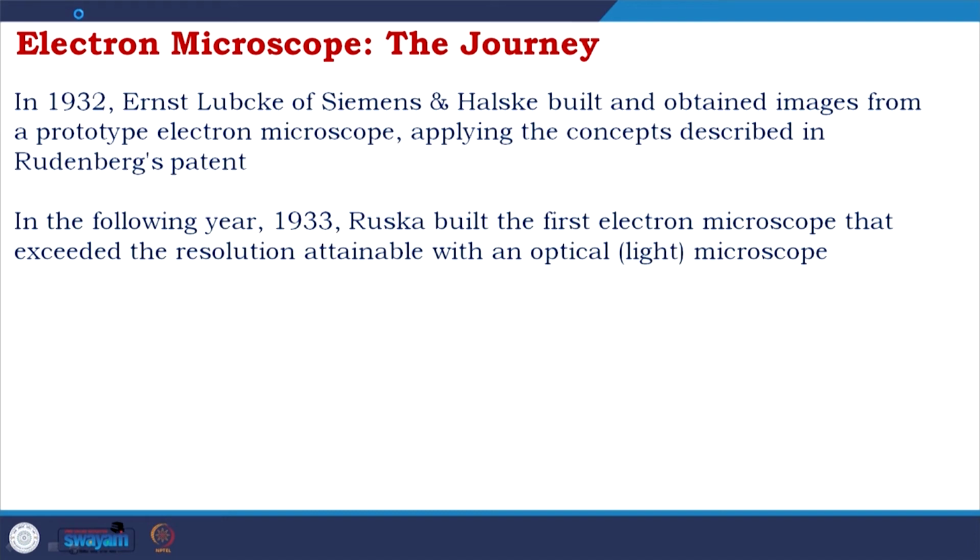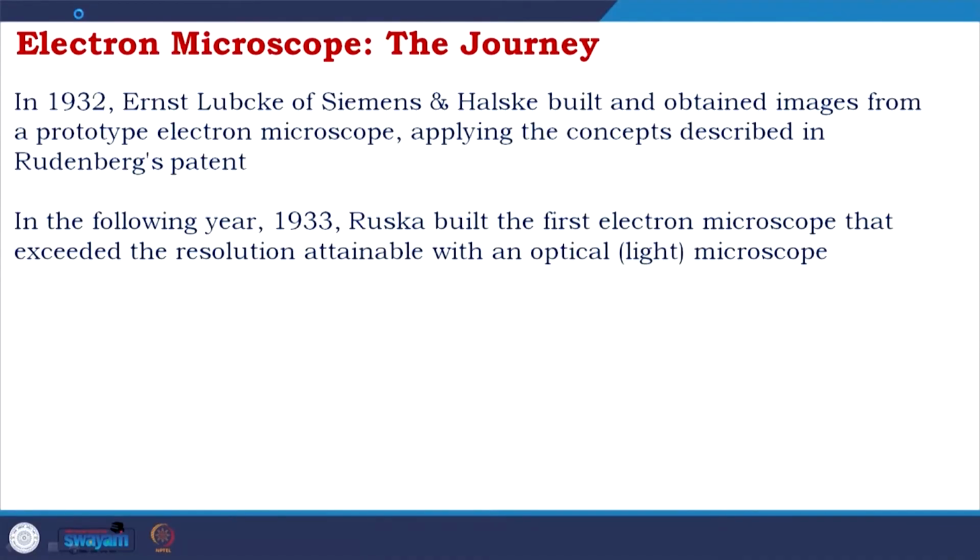So, up to now, though there is always a potential of the electron microscope to give higher resolution in comparison to the light microscope, the instrumentation setup was not giving them enough opportunity to actually attain it. But in 1933, Ruska built the first electron microscope that exceeded the resolution attainable with an optical microscope.